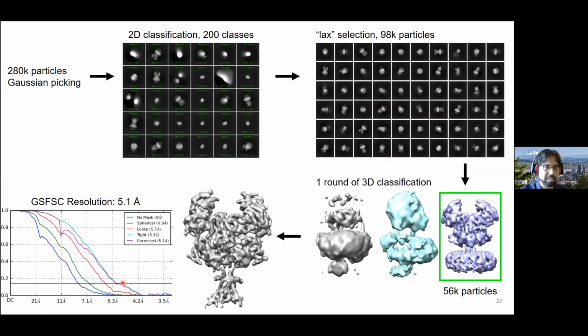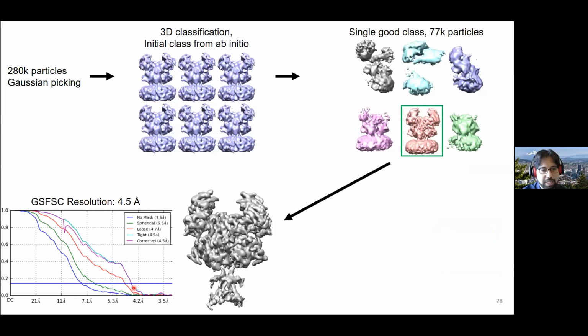Again, this is what I was saying: when you get this flattening, especially around the 0.143 cutoff, you start to question whether this is really at 5.1, or maybe it is at 5.1, but you start questioning things when you get this sort of flattening. But when we went to this high resolution, you can see that it crosses the threshold at a pretty steep angle later on.